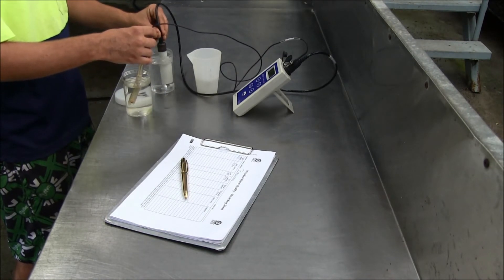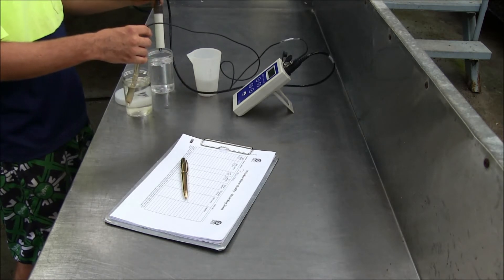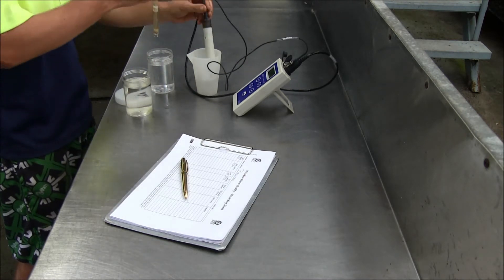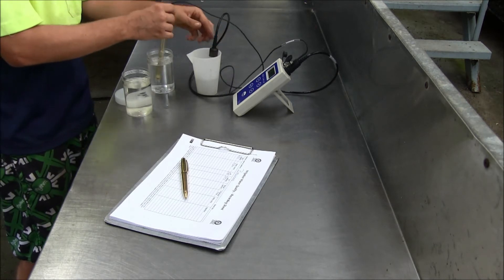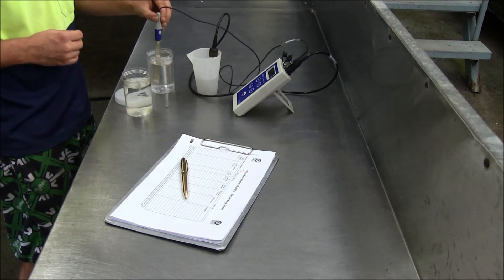The following are some tips for testing water samples. Test water samples as soon as possible after collection. Filter samples if they contain excessive particulate matter. Testing is best conducted at room temperature. Before each use, ensure the testing equipment has been calibrated according to the manufacturer's recommendations.